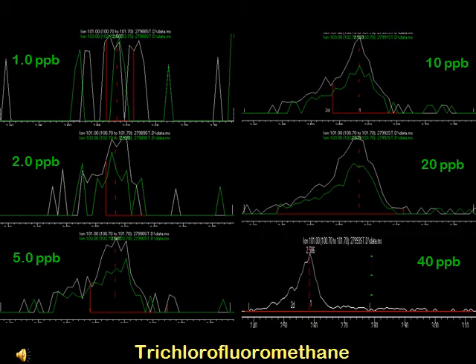A third example is a combination of the two major types of inconsistent standard responses presented in the previous slides. These inconsistencies were introduced by the lack of a detectable peak response and by the manipulation of the analyst. In the 1 part per billion standard, the analyst has inappropriately manually integrated noise where no detectable peak exists. This created response would be apples and oranges to the other standards presented because the actual response representing the analyte does not exist.